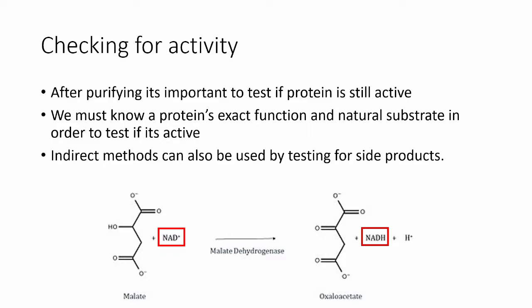So where we are now, we have purified our beta-gal, as well as checking the concentration of our beta-gal using the BCA assay. So now we really know how much beta-gal we're working with, but we don't really know if our beta-gal is active. For all we know, our protein could have degraded somehow where it got all chopped up. Or more likely, it could have been denatured where the protein starts to unfold and unravel into different configurations. And when this happens, the protein loses its function.